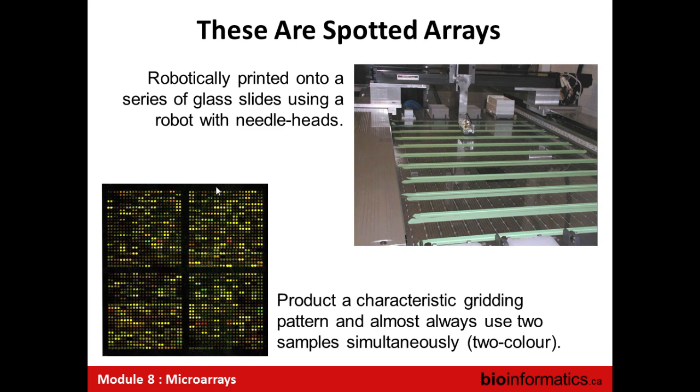So there are a lot of uses for two-color arrays. There's a series of really beautiful statistical papers in Nature Reviews Genetics and things like that from around 2003 that showed how you could use these effectively for a very wide range of experimental designs. But the classic would simply be, imagine that you have two groups, treated and control. Imagine that you put the treated with the red and the control with the green and you compare them directly. Similarly, if you have an individual patient and you have a before and after treatment, then you compare those together on the same array, and you can use that as a kind of control ratio. So those are classic examples where two-color arrays are very natural experimental designs.